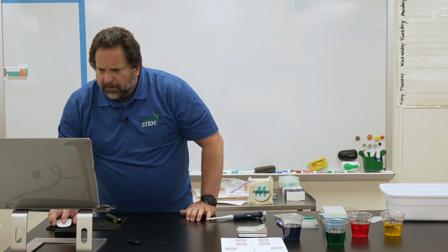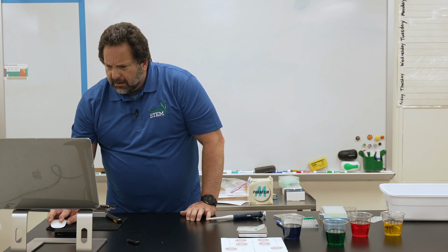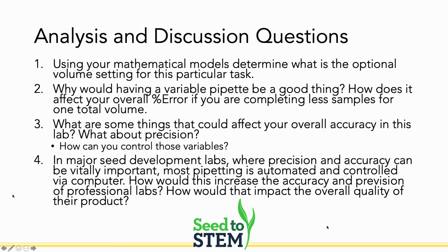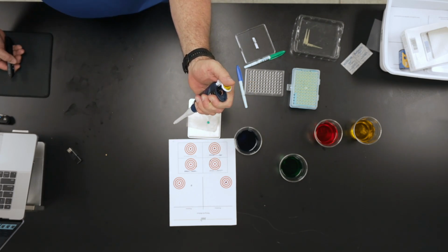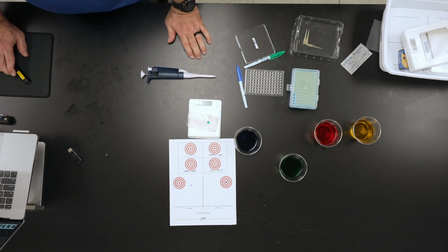Let me pull this up real quick, and here we go. All right, so the goal of this very quickly is to actually try to determine, you've got 2 things. Practice pipetting. You should be very comfortable using this instrument, okay? If you feel comfortable using it and you're not going beyond the limits of the instrument, you should be fine.